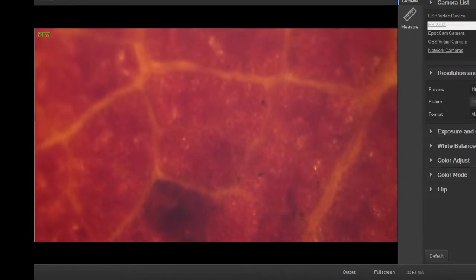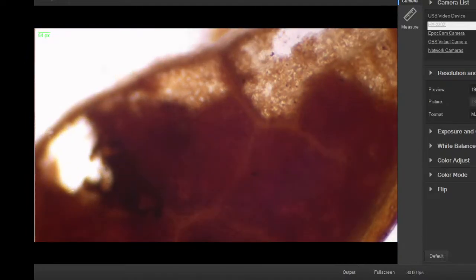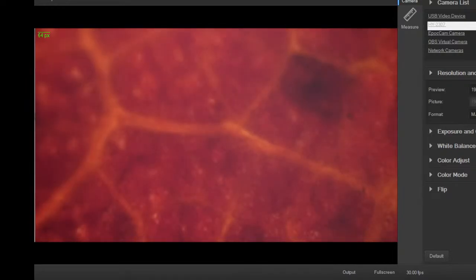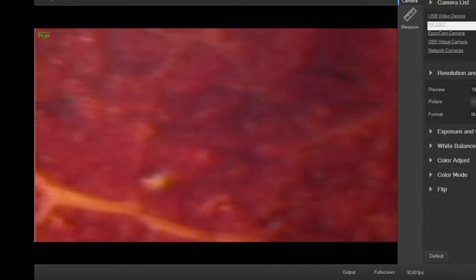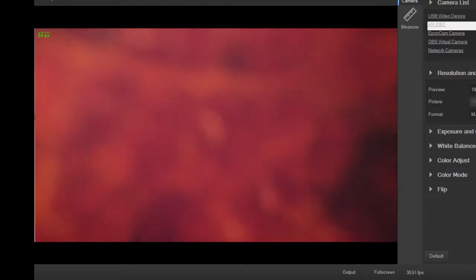It's a little bit off on the camera. The natural color is more of an orangey color, but it's pretty close. See how rigid the veins are, all that material is breaking away in the center, but it still holds the structure of the leaf. The veins persist. Floating by.